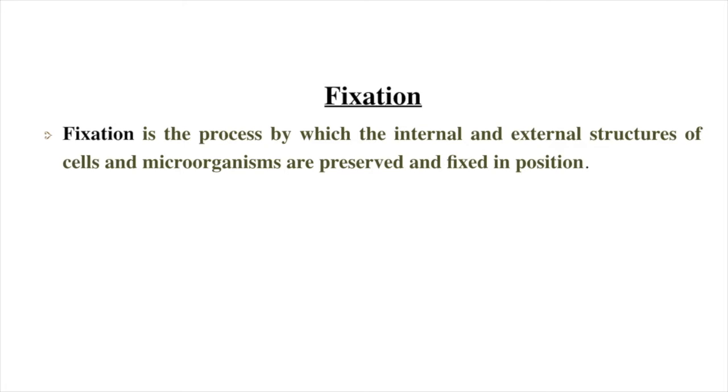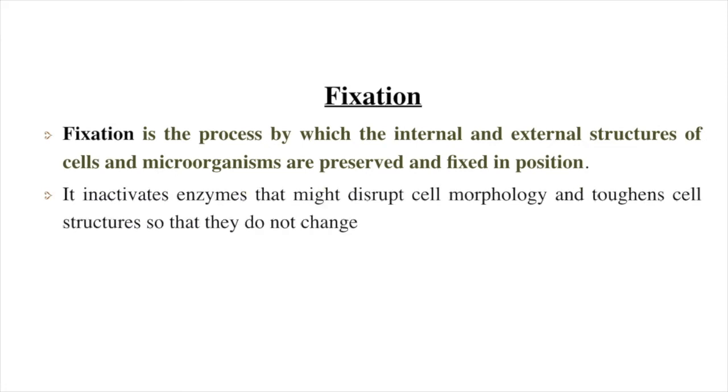So during staining, the cells are preserved and cannot be washed away by the action of the staining dyes. It also inactivates the enzymes that might disrupt the cell morphology and toughens the cell structures so that they do not change during staining and observation.